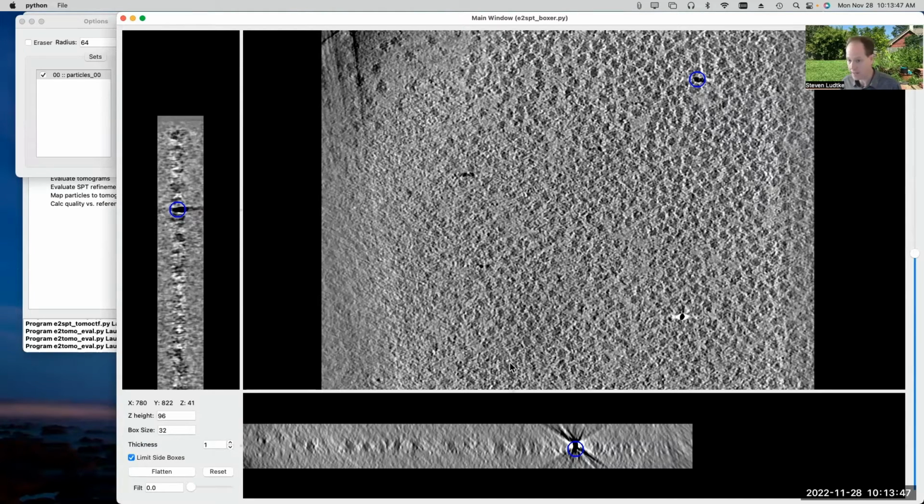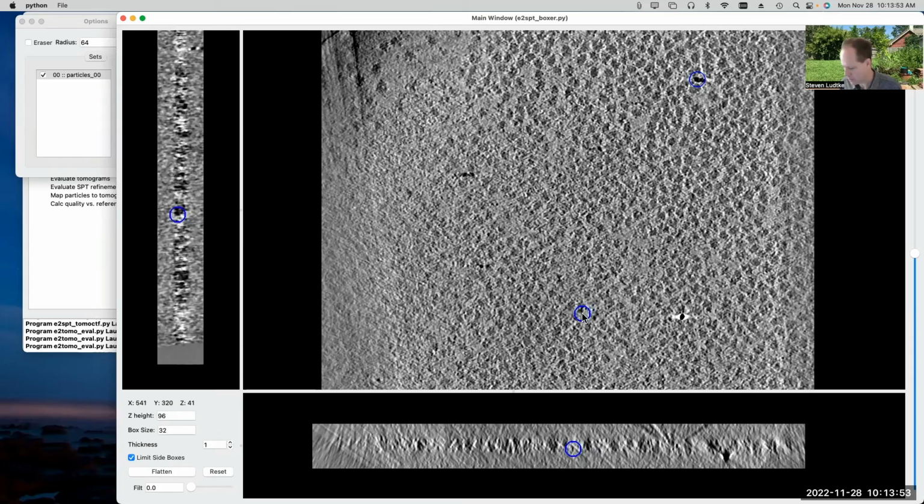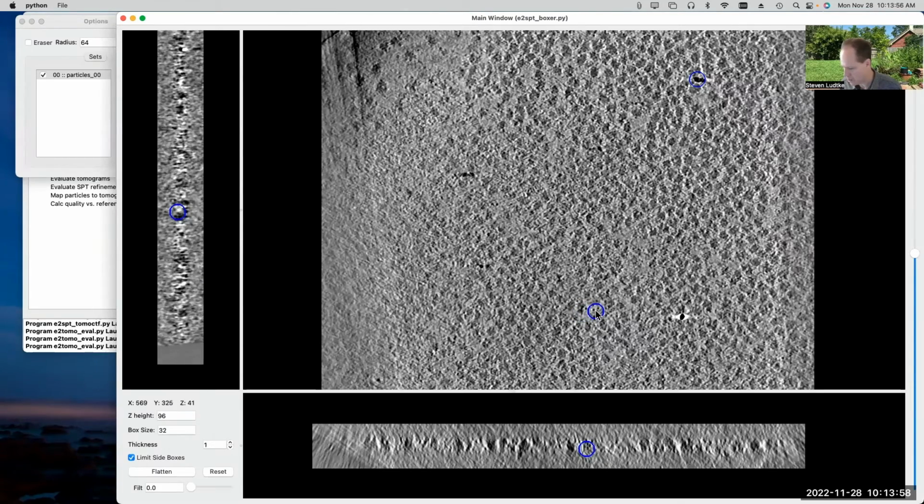Now you'd say, well, you told me not to use gold fiducials at all. And yeah, that's true. If you have any high contrast feature in the image, you can do a similar thing. Wherever you see a dark spot or something like that, you'd like to see that it looks symmetric in all axes, X, Y, and Z.